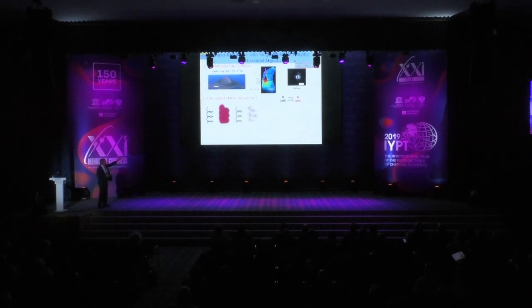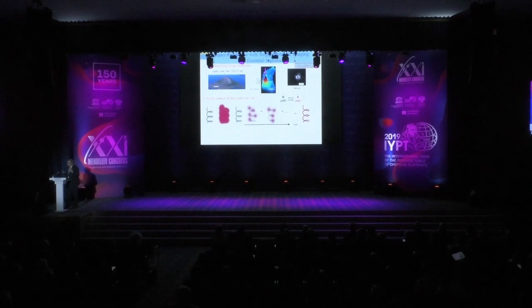I start out dark and then only allow a few to emit. Then I can localize those with the trick above and then photobleach them, and then you localize another randomly selected group, photobleach them, and you keep writing down the positions of all these molecules. In the end, you take all the positions and show them at the same time, and you see structure beyond the diffraction limit. So that's how it works. And this has been called many names with many acronyms. I won't go through all of these acronyms, but a mechanism-independent acronym that we like a little bit is called Single Molecule Active Control Microscopy, or SMACM.